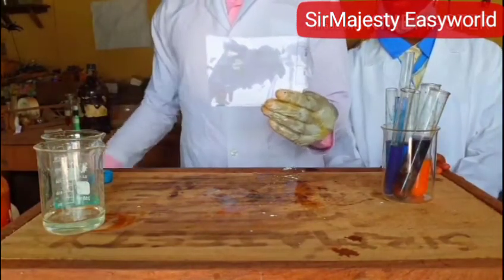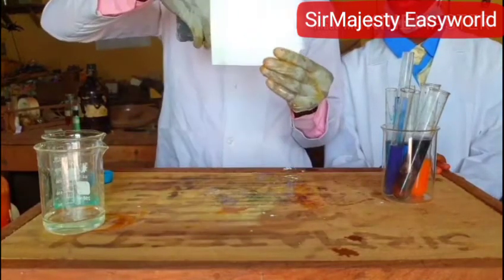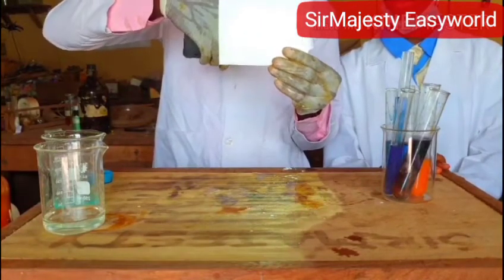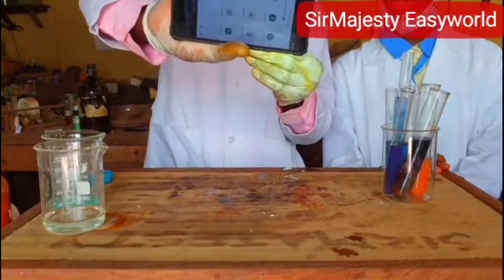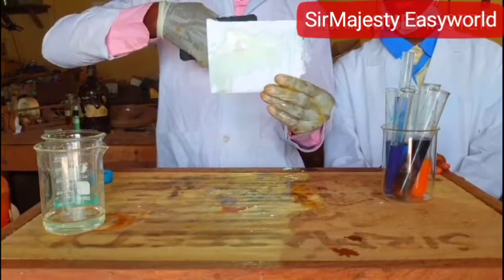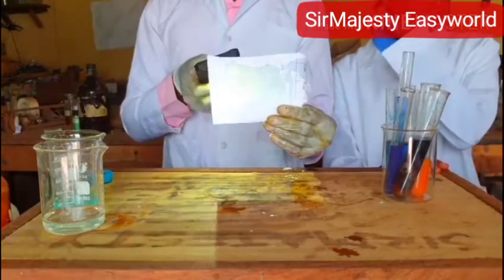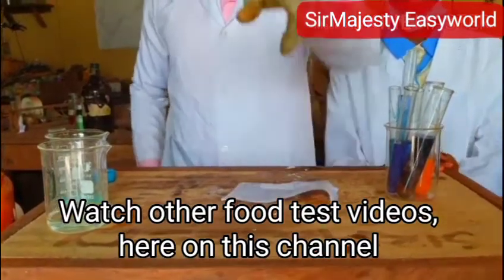Against the light — can you see the light from one side? So translucent means it allows light through. Another test for lipids is usually Sudan dye, which stains oil red.